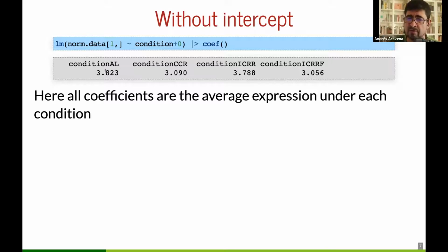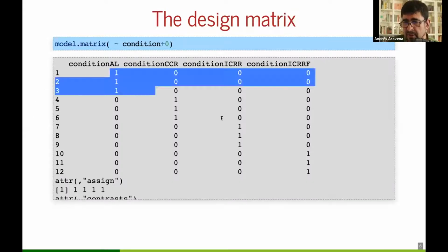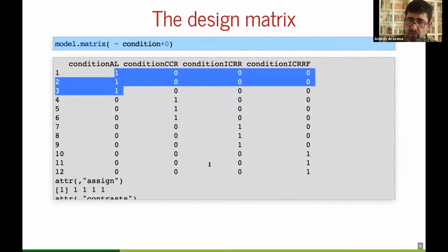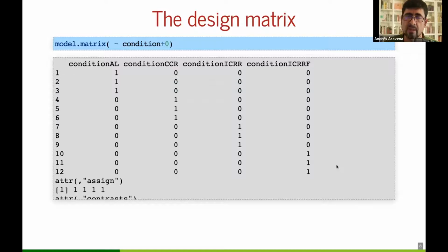You have to do the difference manually, which is possible, but not necessarily a good idea. And then there is also the corresponding matrix, which is very easy: 1 when the condition is true and 0 when the condition is false. We're going to use this later. I am just reminding you that for every formula that we write here, the important part is the second part. The first part is not important here.